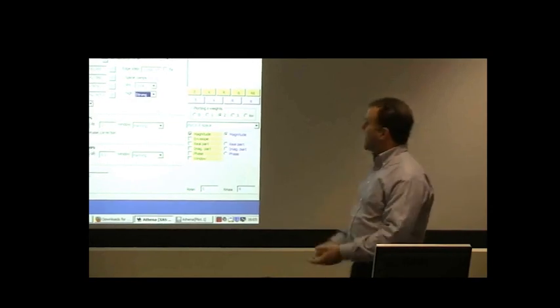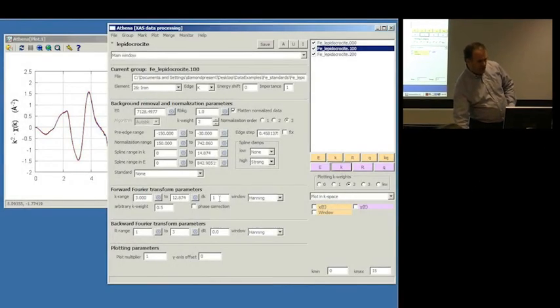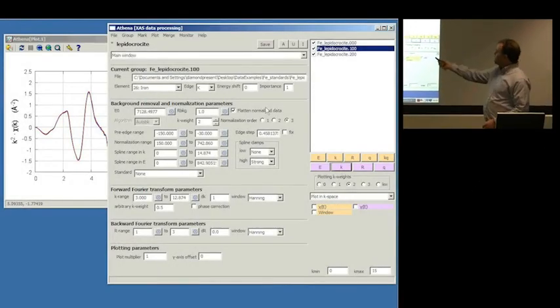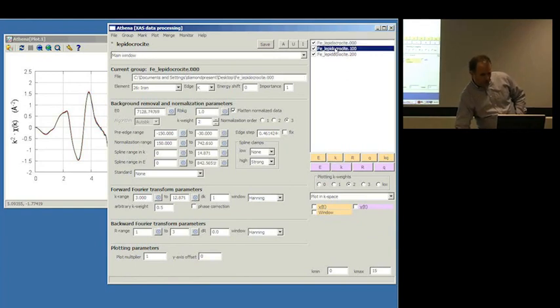So to demonstrate what I mean by this, I want to remake this picture, but with one of the E0 values chosen to be very different from the others. So we see, if we look at them all, that they're all 7128 point something. So they're all chosen to be pretty close right now. But they're not exactly the same.